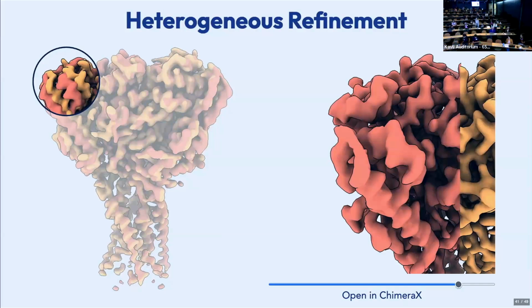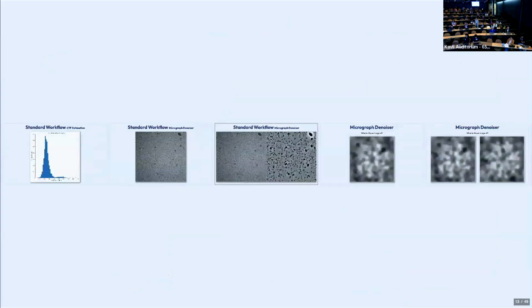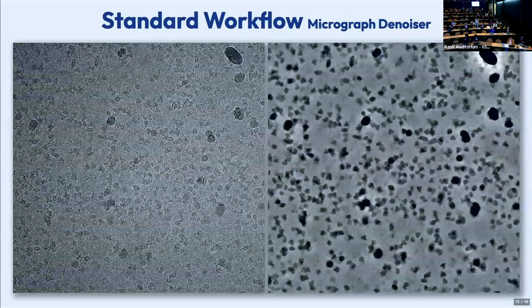Hi, there's a question we didn't discuss much, but I'm curious about this denoiser you used, because my impression is denoising micrographs is usually to facilitate manual labeling for further training of a deep picker, because you lose a lot of high resolution information. Do you also use a denoised image for template matching, or is there any caution to take when you feed the auto picker with denoised images?